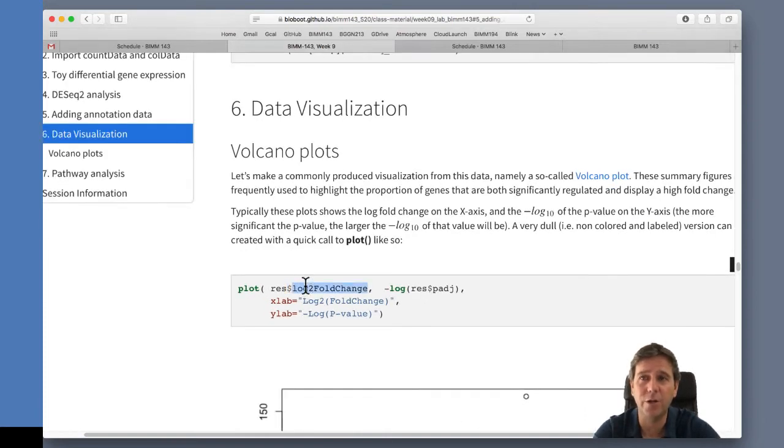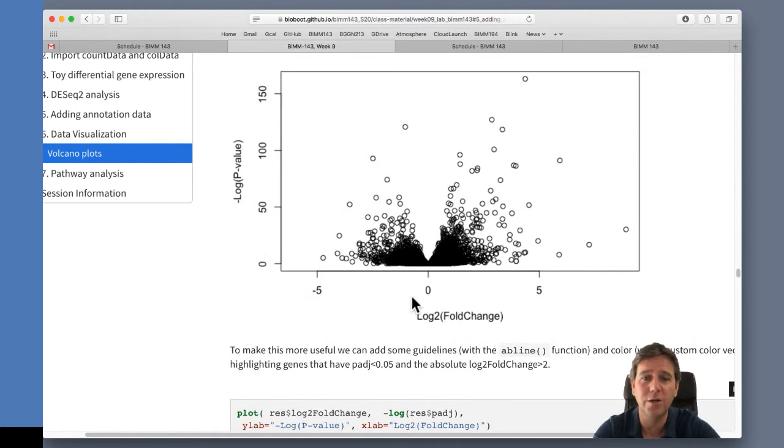As the x, that's going to be along the bottom, so that's the fold change here. So 0 means no difference, it's exactly the same value. And of course, if we go this way, into the minus of the fold change, that means it's down-regulated. If we go the plus way, it's up-regulated. So the further away from the middle, the more the change, right?